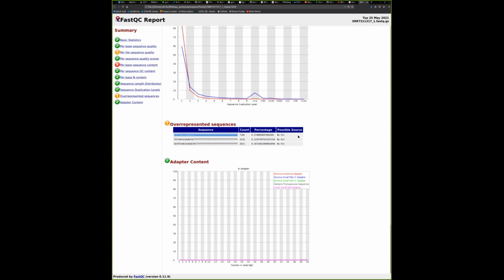So you can do a very simple BLAST search. And I think it came from a repeat element from somewhere. I can't remember the name of the gene. Again, you can see it's very easy to get overrepresented repeat elements. So we will try to remove this by some sort of quality removal later on.